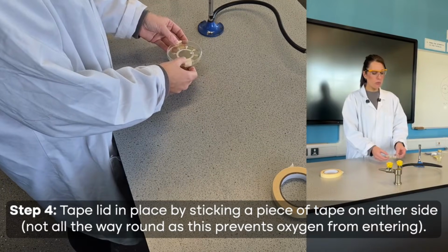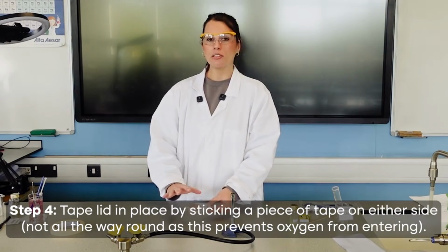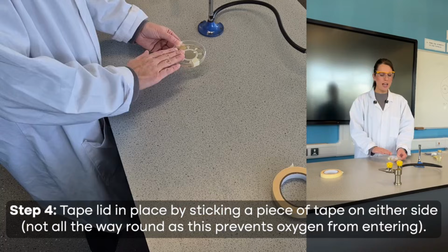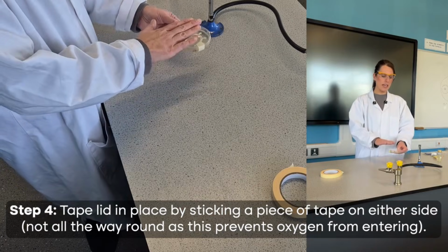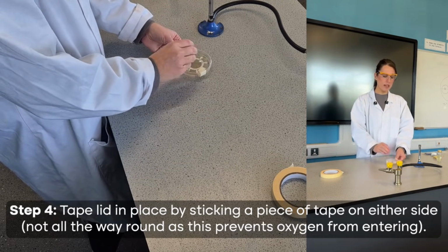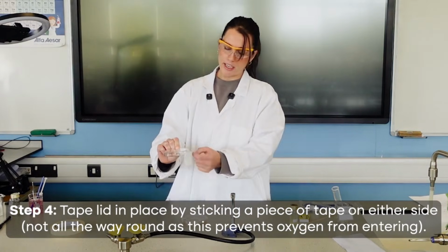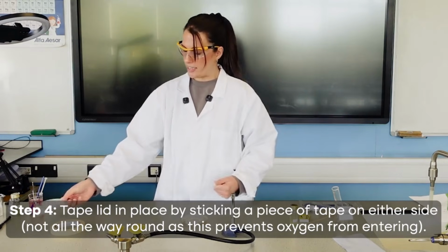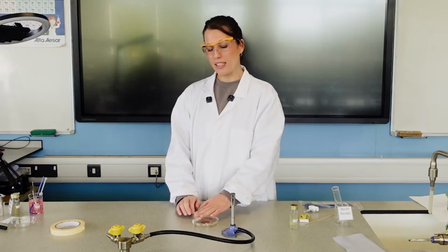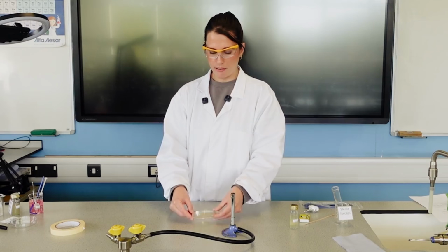And then when you're ready, you would place your dish upside down because at the moment, the bacteria that are there, they're going to respire, and water in the form of water vapor is one of the products of aerobic respiration. And that water vapor is then going to rise to the lid, condense, and it can drip back down onto the dish. And if you then have pools of water, that can affect the inhibition zones. So instead, we flip our dish upside down so any condensation lands on the lid. Now, sometimes I do get the students to wait just about a minute or so before they do that because it is still quite wet in there and everything might just fall upside down. But let's give it a go.